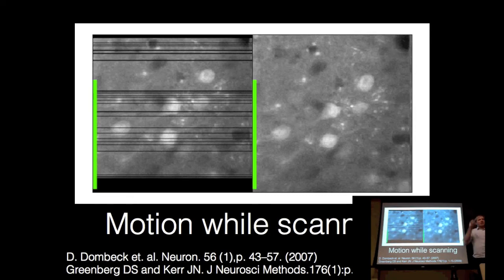But if you acquired the data from the wrong frame, if this cell body is no longer within the frame, then you're out of luck, right? So the in-plane motion is a much better situation, because if I move the sample up, I'm still going to get to this spot later on in the frame, except for at the edges, right?